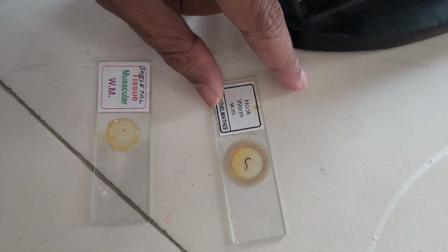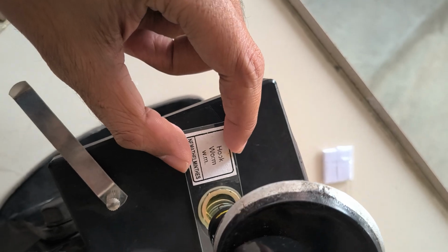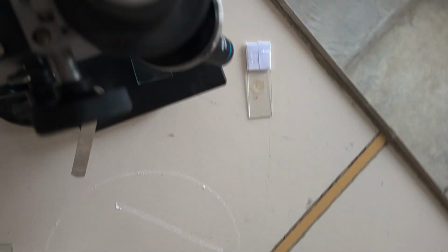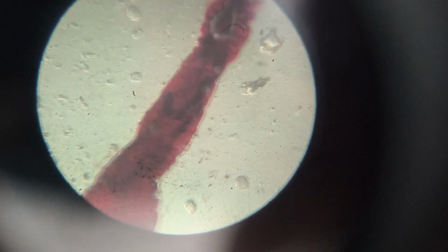Hello guys, now I will show you a few of the slides, that is hookworm muscle tissue. Let's see the hookworm. See, I'm putting it right now. Let me see it first. Okay, this is how the hookworm looks from the microscope.